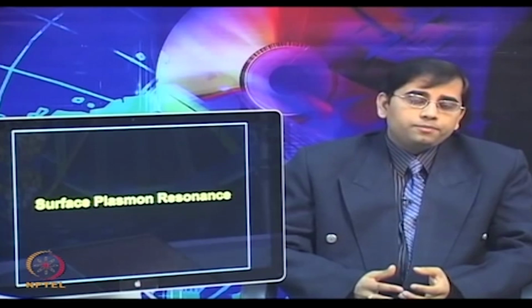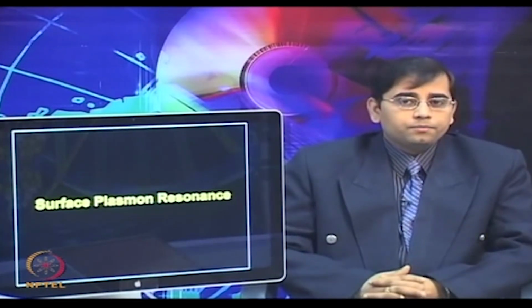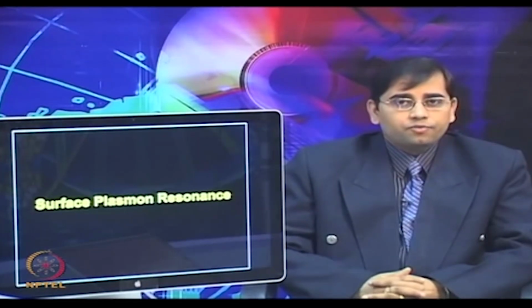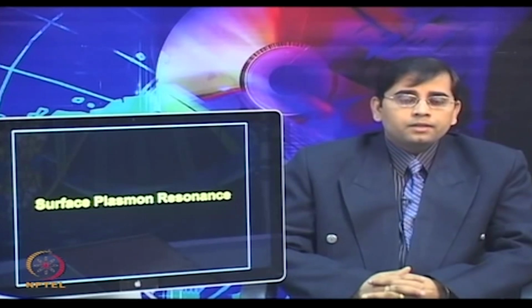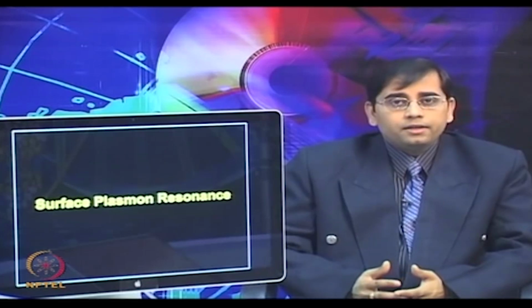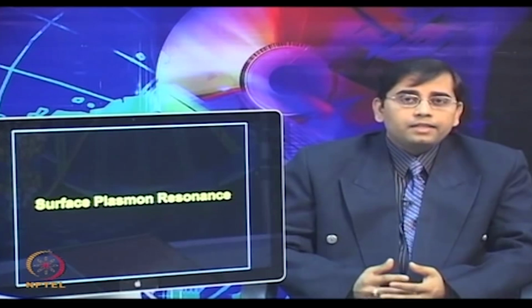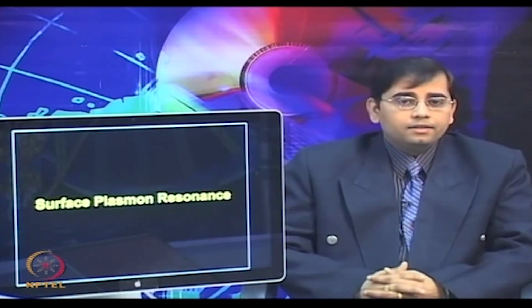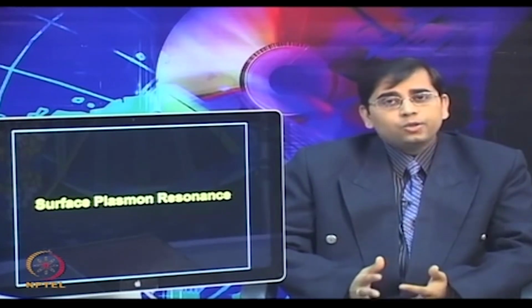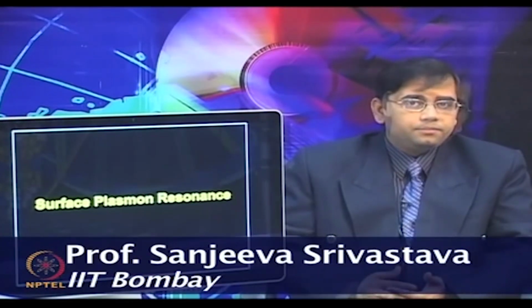Binding of molecules in the solution to the surface immobilized receptors changes the refractive index of the medium near the surface. The change in the refractive index of the medium can be monitored in real time to measure accurately the amount of bound analyte, its affinity for the receptor and the association and dissociation kinetics of the reaction.